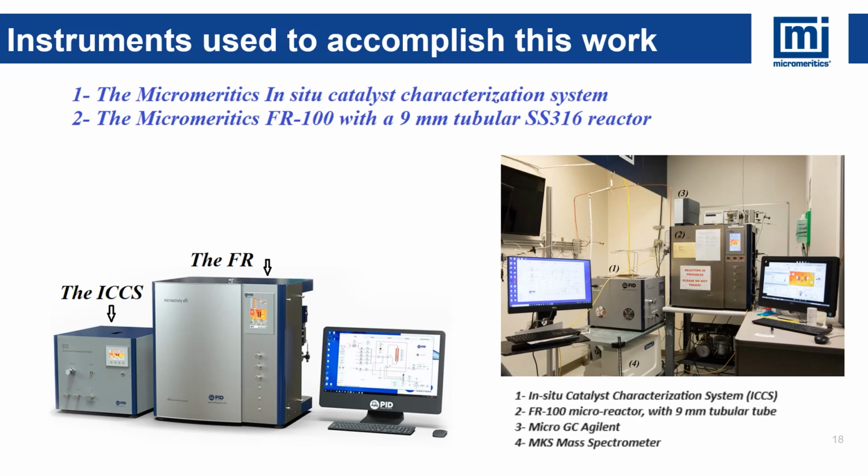And that trap does not require any cryogenic dewar or cryogenic system, because it works with a Peltier system. Once you turn on the instrument, it goes directly to 4 degrees C. You can also change the temperature between 4 and 60 degrees C, so that at 4 degrees C the water will be trapped before reaching the TCD. So it will not alter our TCD profile.